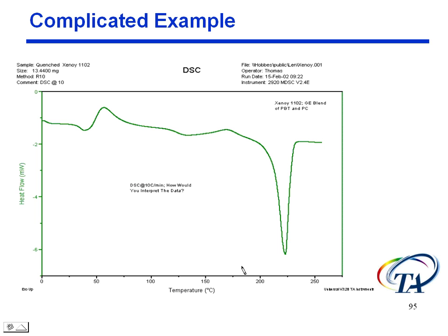Well, the first thing you could say is, okay, this looks like a melt. That's pretty safe. And this looks like an exotherm. That's pretty safe. But where's our baseline? Is this an endotherm there, maybe? And this is maybe another endotherm? Possibly. Or is this an endotherm followed by a little bit of an exotherm? Or is this a glass transition? It becomes difficult to see exactly what's going on with this sample.